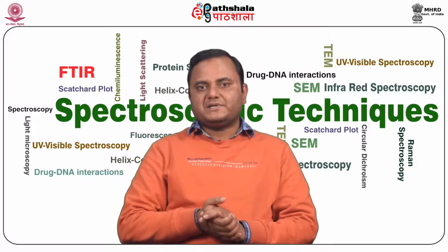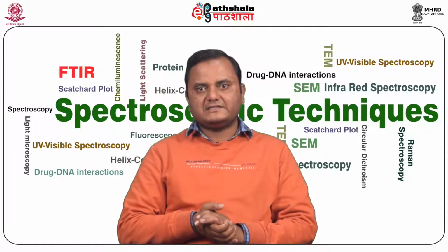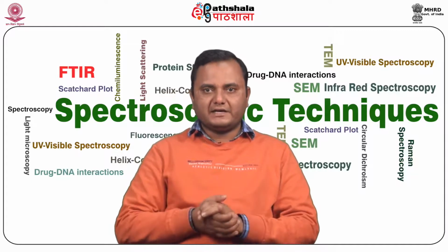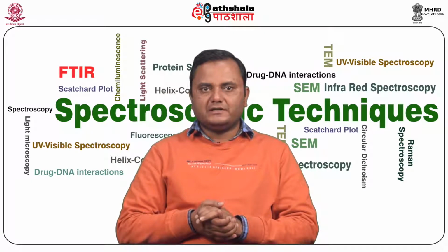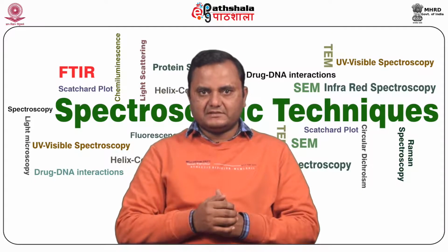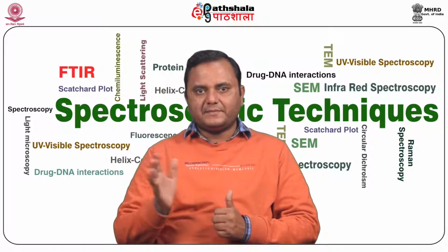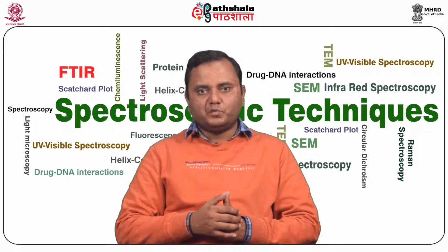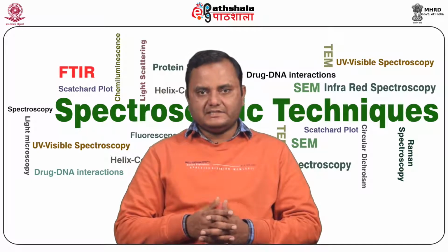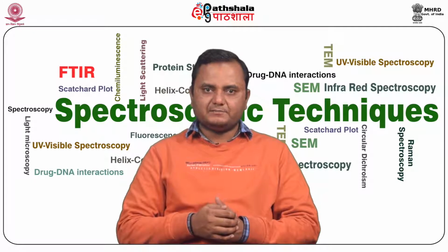ORD spectra are dispersive, called a Cotton effect for a single band, whereas CD spectra are absorptive. The two phenomena are related by the so-called Kronig-Kramers transforms. The maximum of the CD occurs at the absorption lambda max. Where there is more than one overlapping Cotton effect, the CD may be easier to interpret than the ORD with overlapping S-shaped bands.